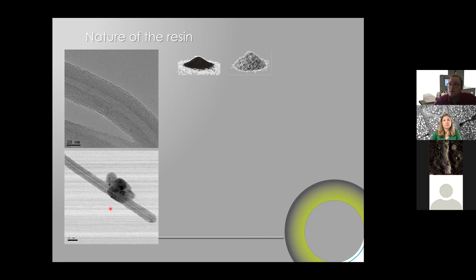And one of the first things we realized is that even if you take so-called carbon nanotubes, indeed they're nano, but if you look at this image and at the scale bar here, you would realize that this carbon nanotube will never ever go through the plasma membrane of a cell, simply because it's way too big. And so it cannot diffuse inside the cell. Since it cannot diffuse inside the cell, the best case scenario would be that these carbon nanotubes drain the electrons outside of the cell, but not inside where we have the material of interest. So we did not go into this carbon nanotube approach to start with.